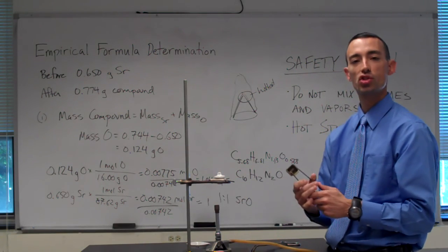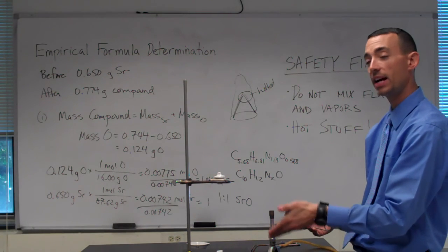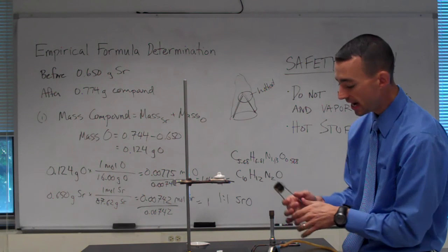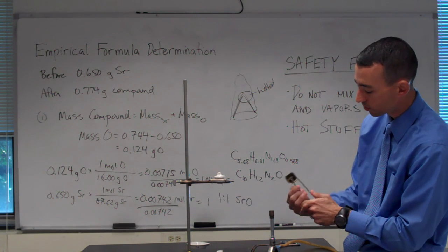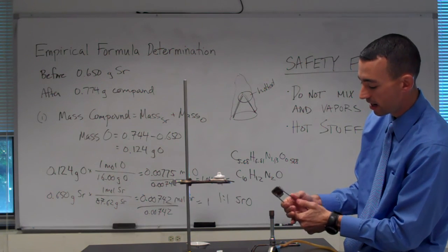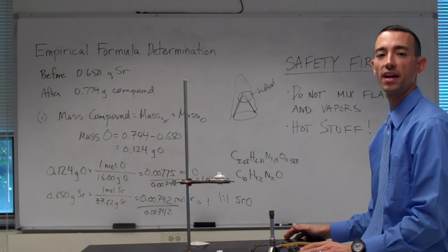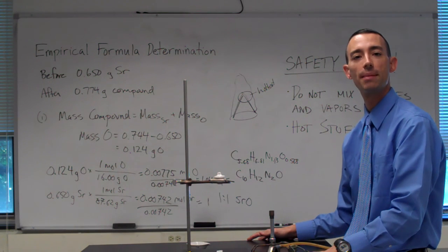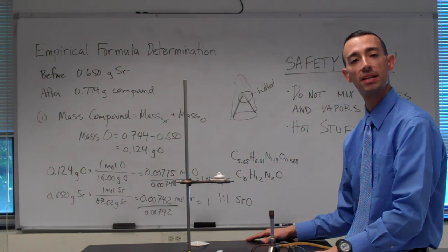This is the striker to light the Bunsen burner. The proper way to use this is, again, to have the gas flowing, but have this at the ready. Once you hear the gas, hold this at an angle above and strike. Simply draw it across the flint, and little sparks should emit and light the flame. If you're really nervous, ask for some help from the student lab assistant or the professor in the lab today. We'd be more than happy to help you get things started.